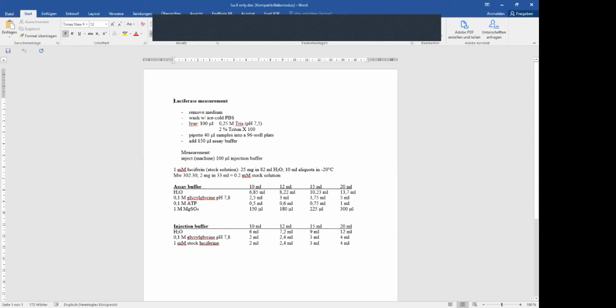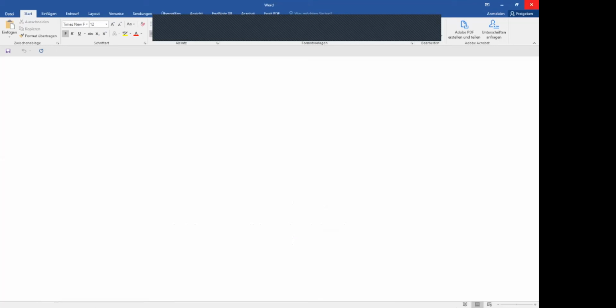Then what you see here is the composition of these stock solutions. In case you want to do it in the future, this was done like it's written here. So this protocol you have received before. And now we go back to the video.